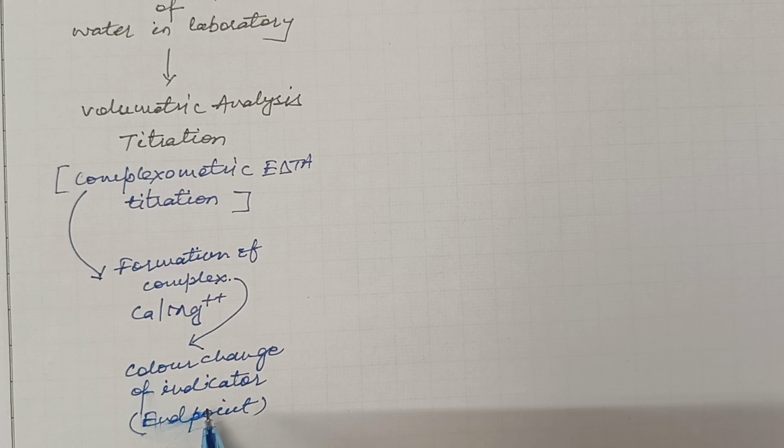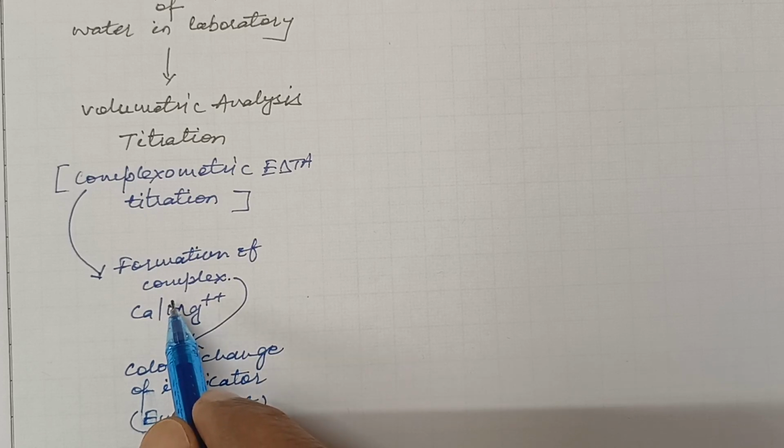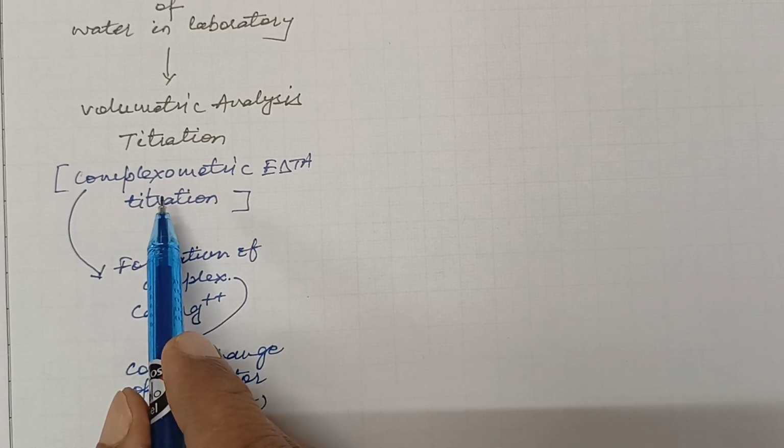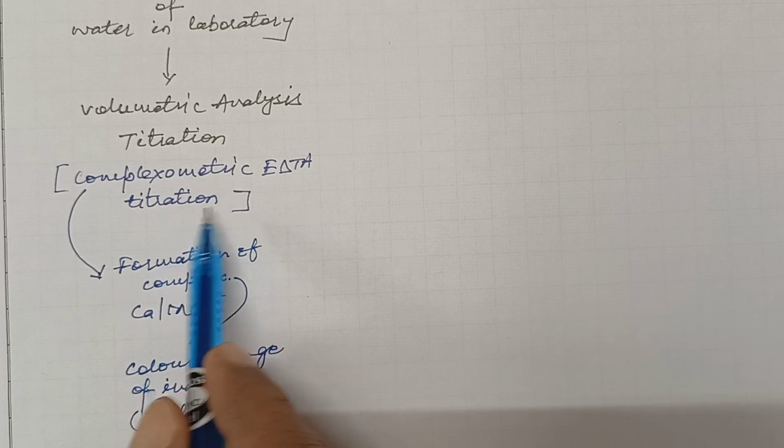The endpoint comes from the formation of this calcium or magnesium ions complex. That is why this titration is called complexometric EDTA titration.